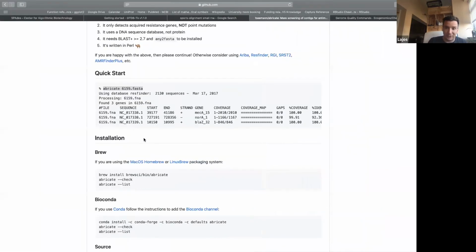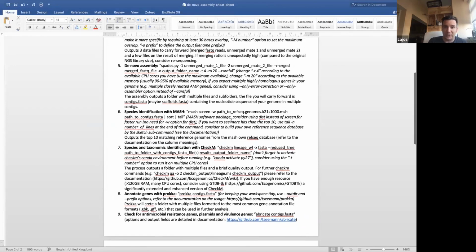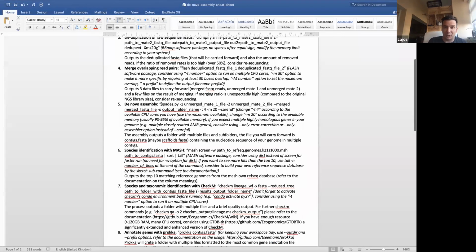As I said, the document will be up there, so you can come back and do it anytime. All the command line commands are the first things here. So if you see it between quotation marks, of course, you don't have to put the quotation marks there, but these are always the command line commands.